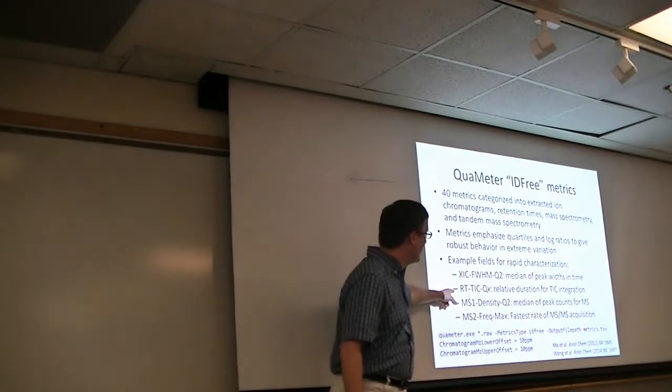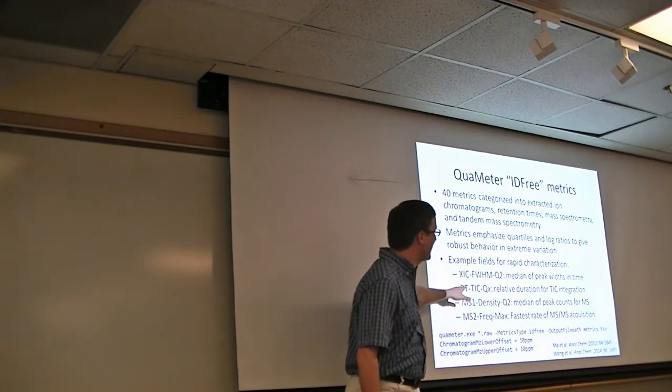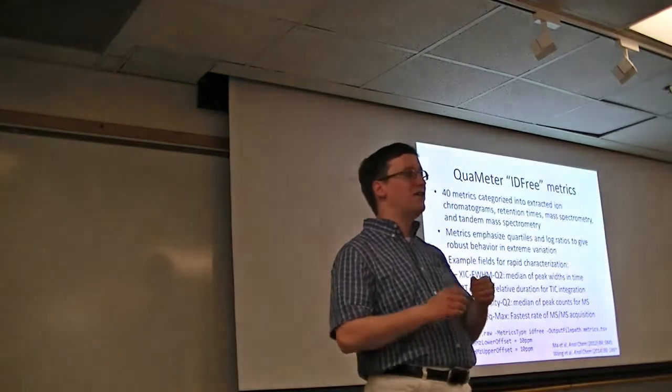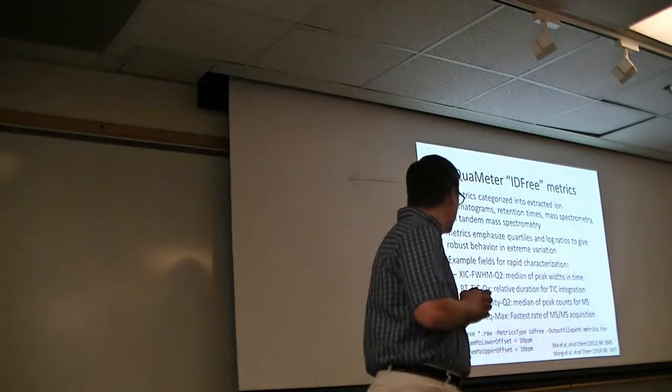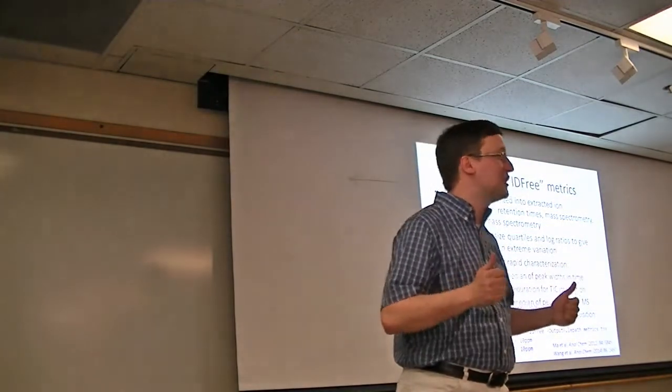Now, when we get to the RT-TIC quartiles, we come up with a more obscure one. Let's imagine that we have a, was this the MS? Yeah, it's MS. We have some amount of signal that's seen in each MS scan.